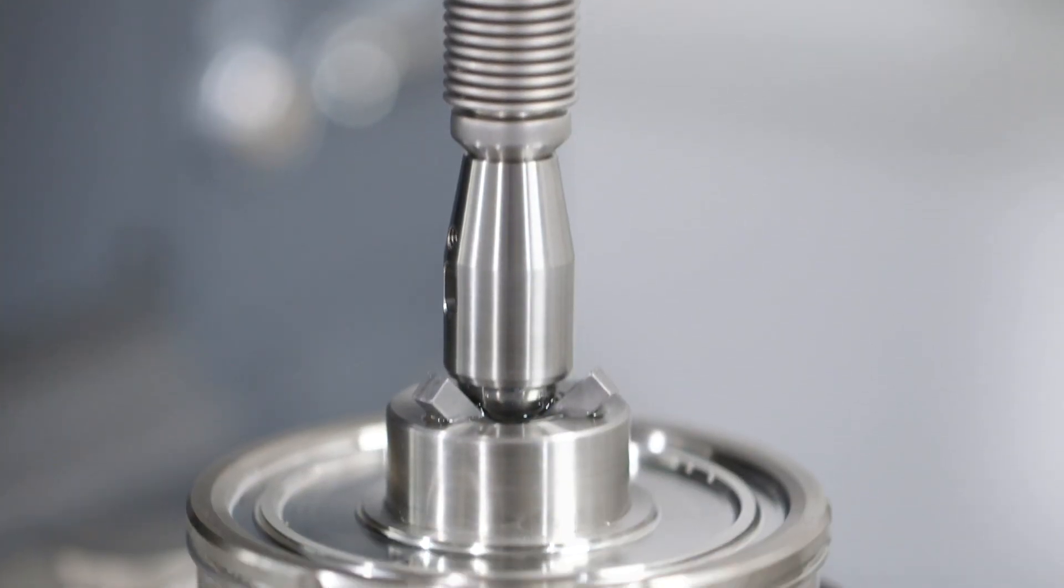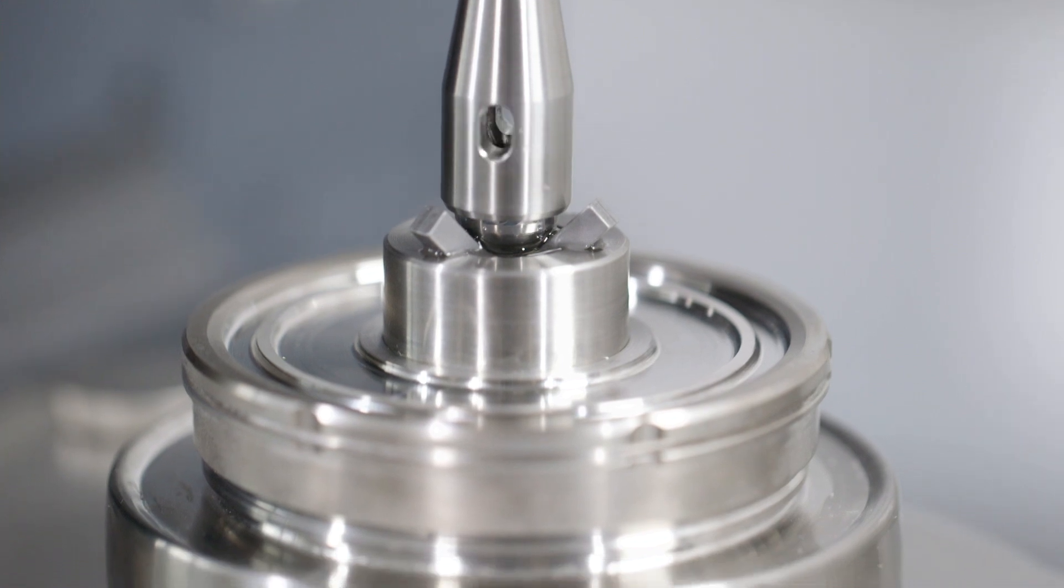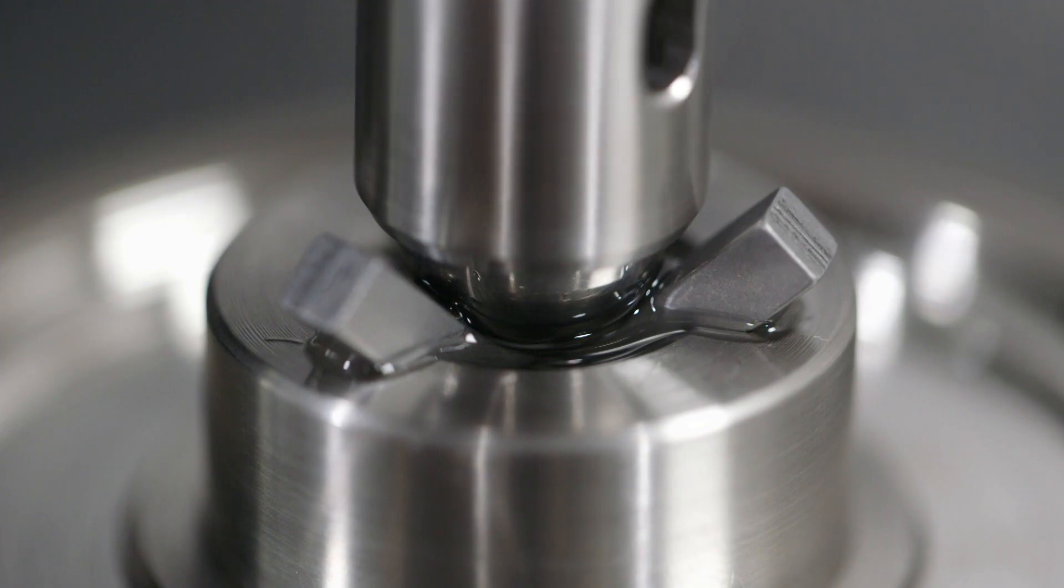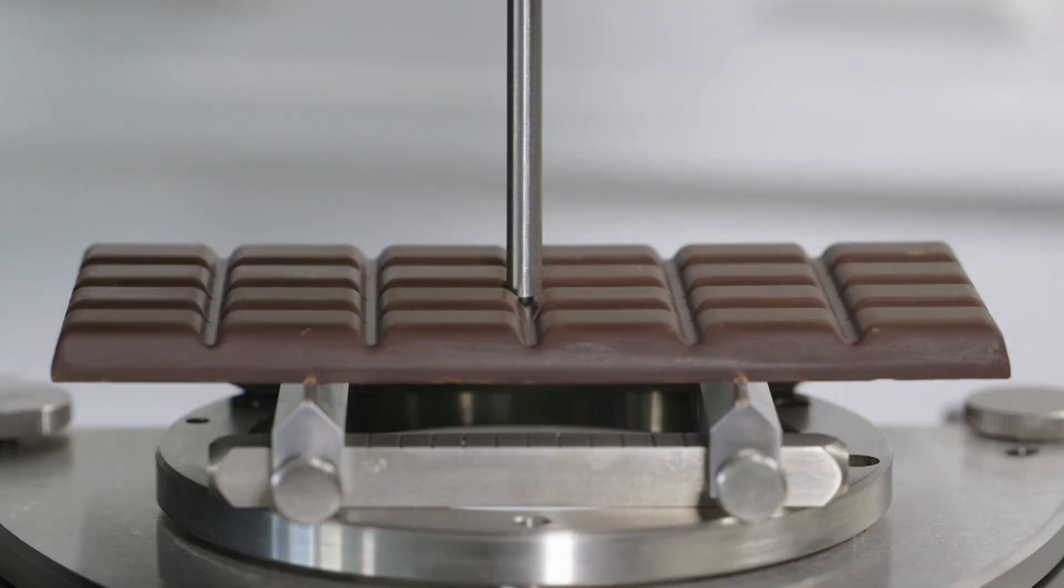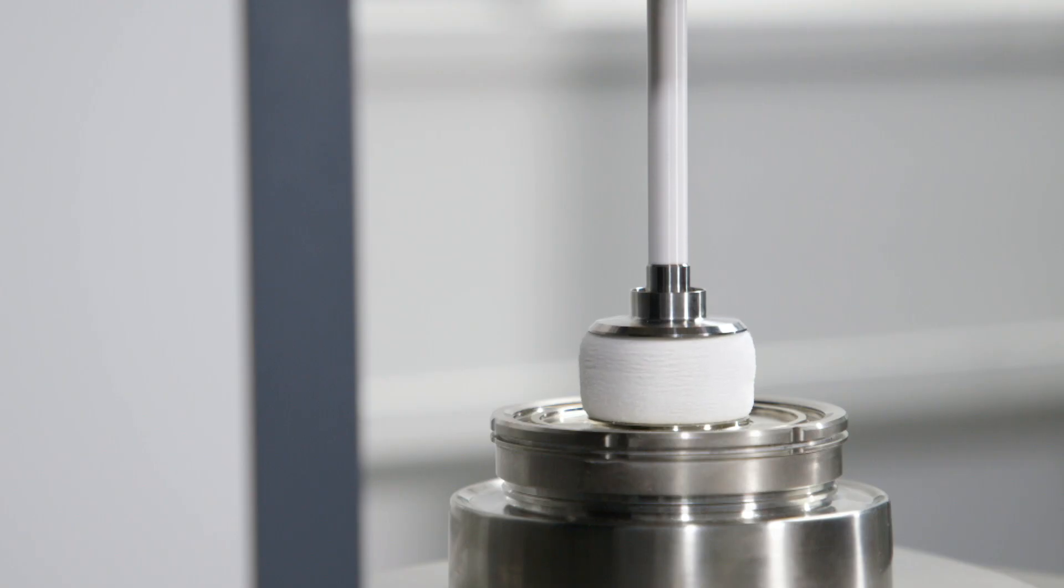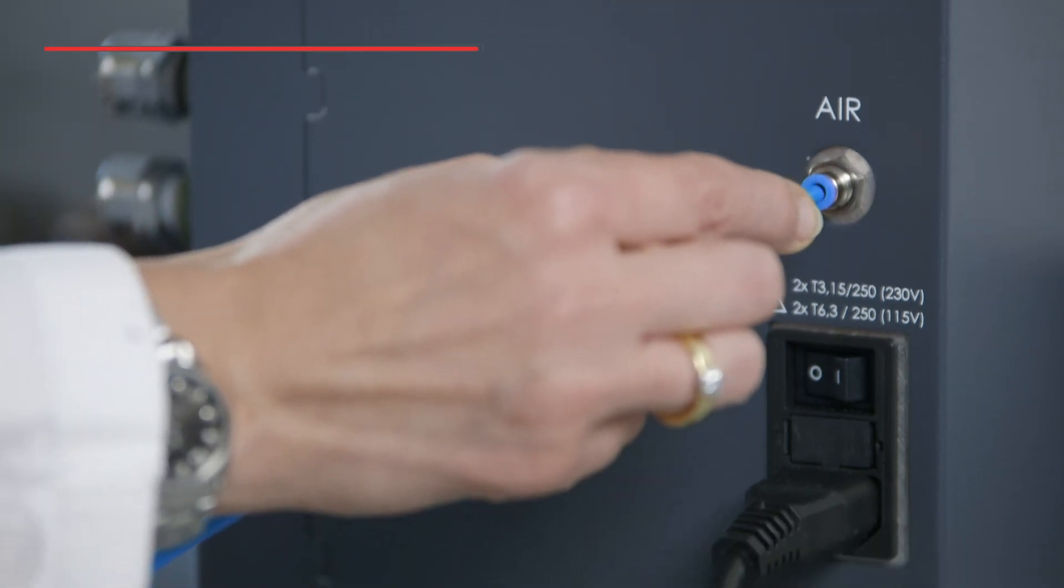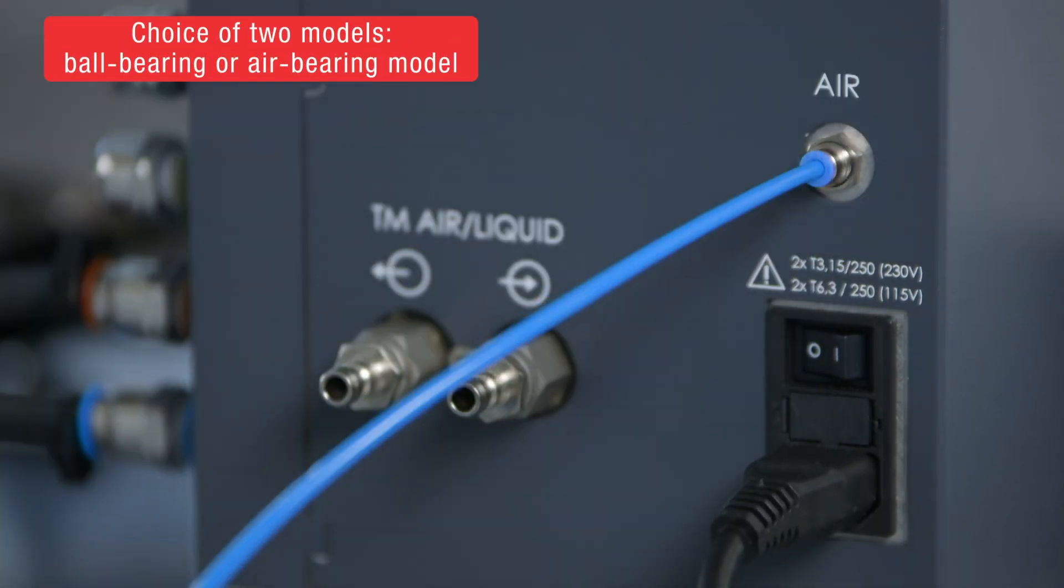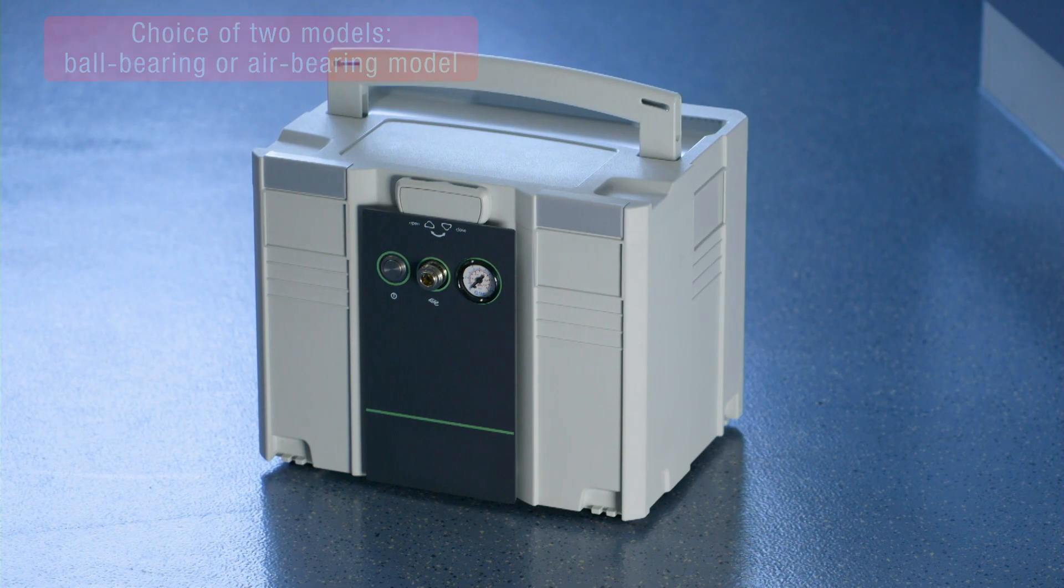Extended measuring capabilities include tribology measurements for testing friction, lubrication and wear, or texture analysis for bending, breaking or squeezing tests. Two versions, ball-bearing or air-bearing model, help address multiple applications.